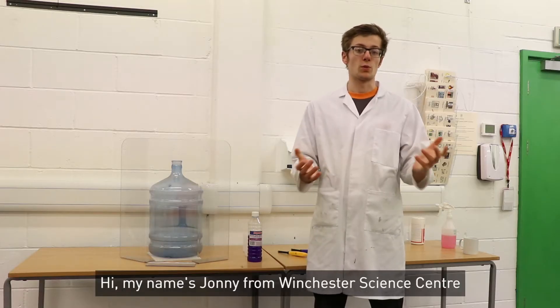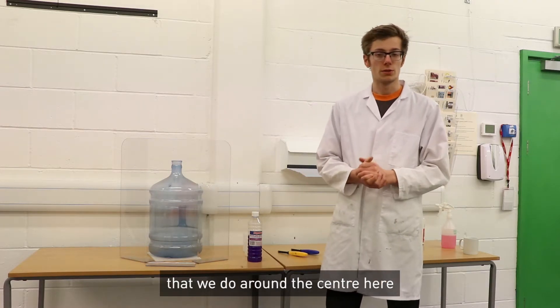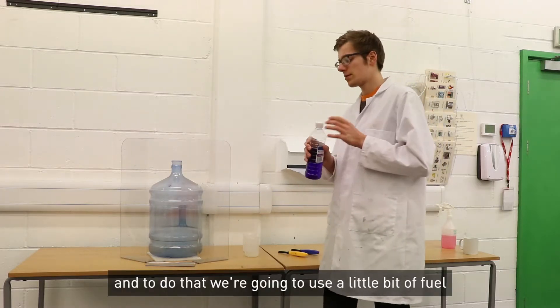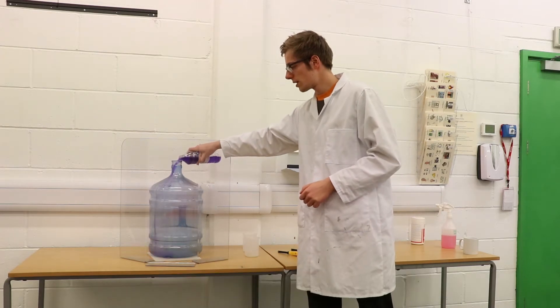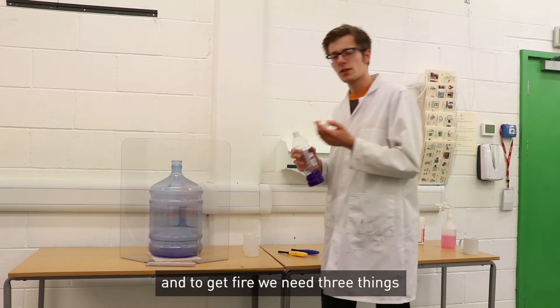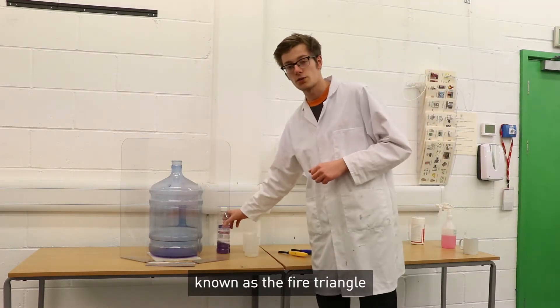Hi, my name is Jonny from the Winchester Science Centre. Today I'm going to show you a little experiment that we do around the centre here. We're doing a whoosh bottle and to do that we're going to use a little bit of fuel. Now this is going to make a bit of fire and to get fire we need three things known as the fire triangle.